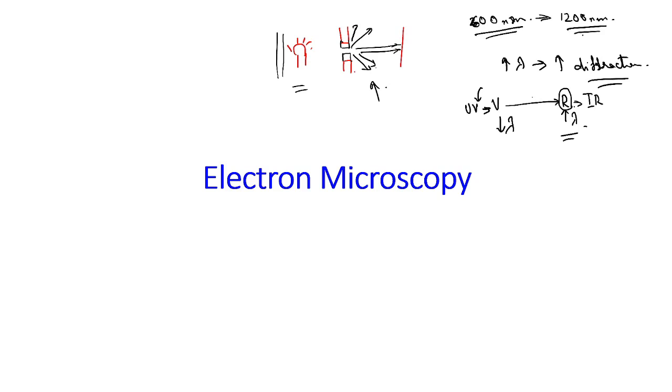Why is that so? Because within that 1200 nanometer you will have this wavelength interacting with the 1200 nanometer particle in a proper manner.